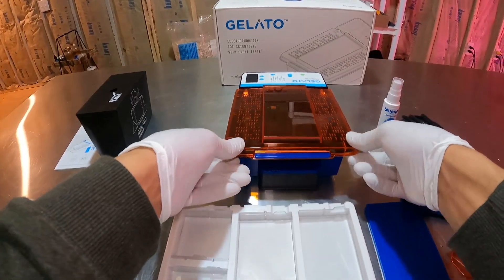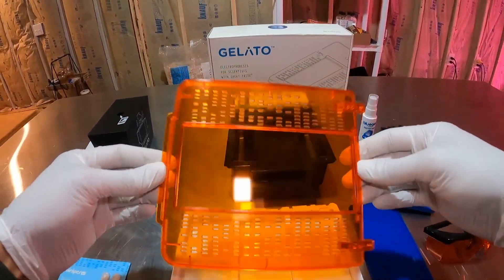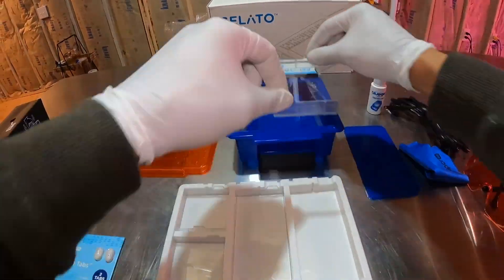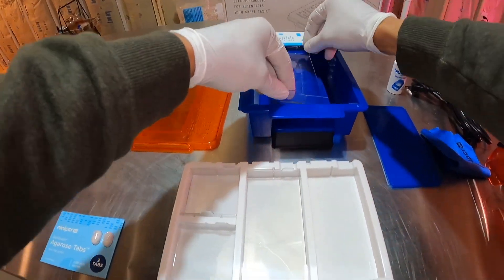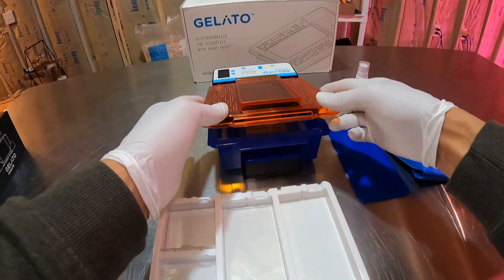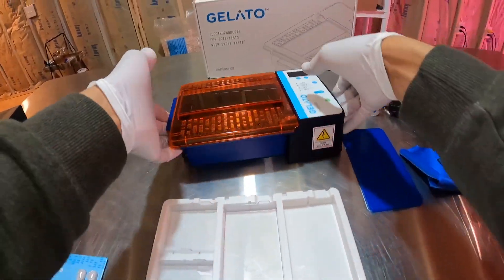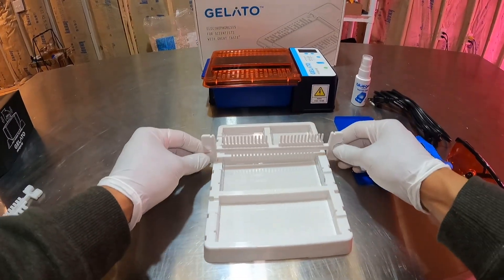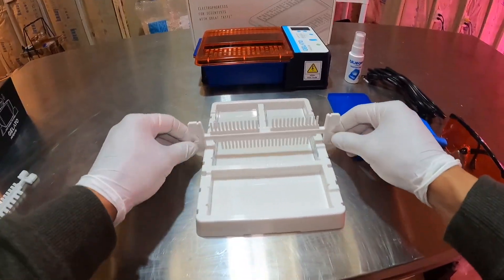The lid just slides right off. The lid needs to be connected when we're running our electrophoresis for the electricity to flow through the gel. At this point I just started to fiddle around with how the combs fit into the casting tray.